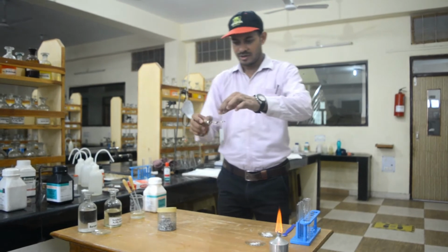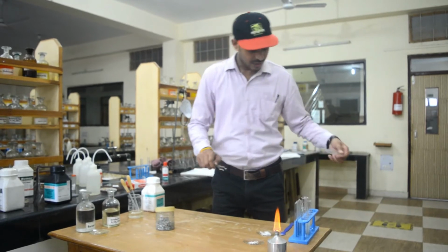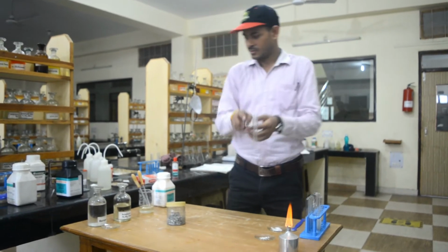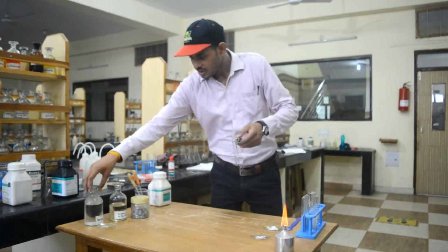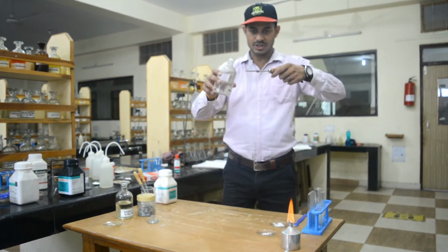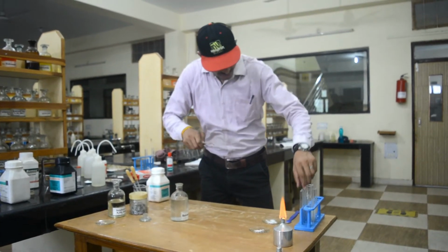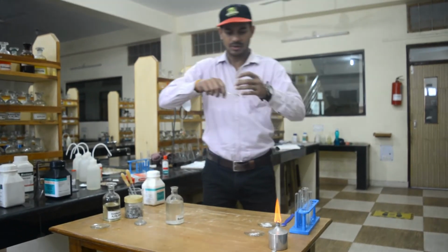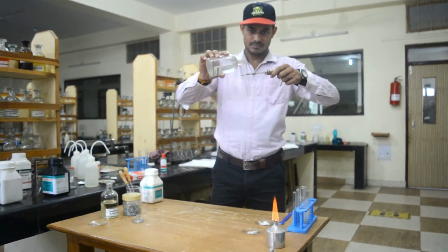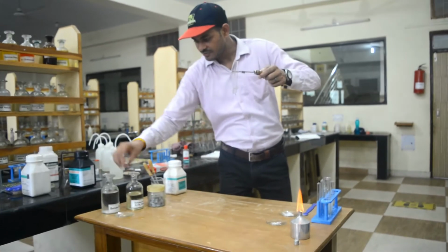Now let us do the next one, the double displacement reaction. Again I will take a test tube. For this, I will do the reaction between barium chloride and sodium sulfate. First of all I will take the barium chloride, in another test tube. I have taken the barium chloride. Now I will add sodium sulfate in this.